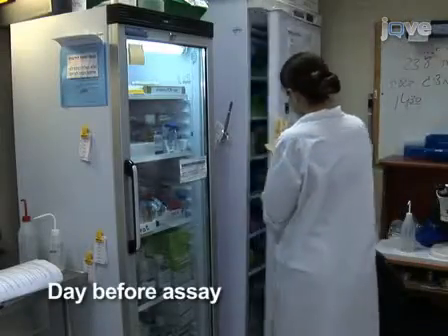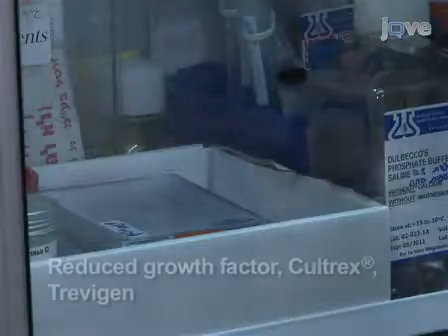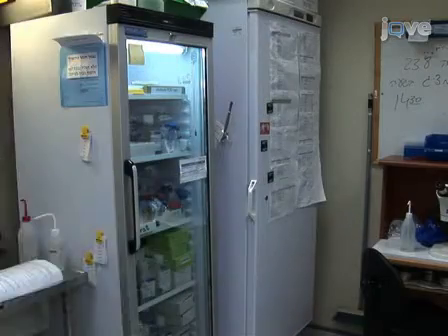To begin this procedure, allow the basement matrix extract, or BME, to thaw on ice or at 4 degrees Celsius. Once thawed, continue to keep the BME cold to prevent it from solidifying again.